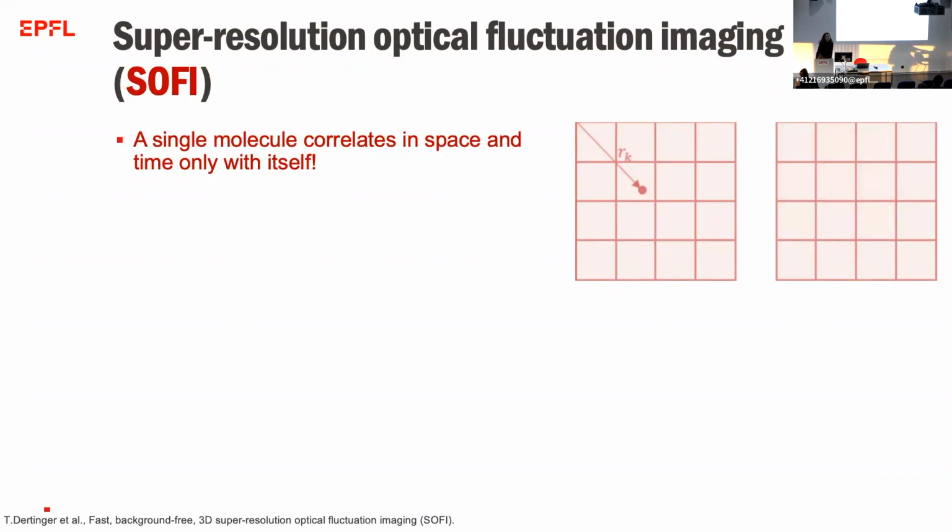So we sacrificed a little bit on the resolution side and decided to work with a modality in super resolution microscopy that also relies on blinking fluorophores, called super resolution optical fluctuation imaging. Instead of localizing, as I guess many people here are familiar with localization type microscopes, we correlate the blinking between neighboring pixels, and using special mathematical tricks, we can push the resolution of the microscopy further.